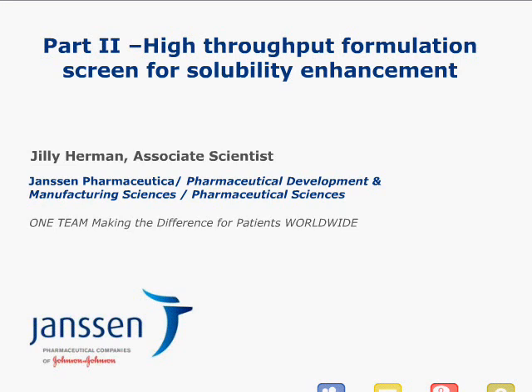Okay. Morning, everyone. I would like to present you today some more about the high throughput screening work we perform on drug product formulation. First of all, I would like to give some background information, and after that, some strategies for how we can improve solubility. Further, I will explain the high throughput formulation screens, which help us to improve the solubility, and some case studies.